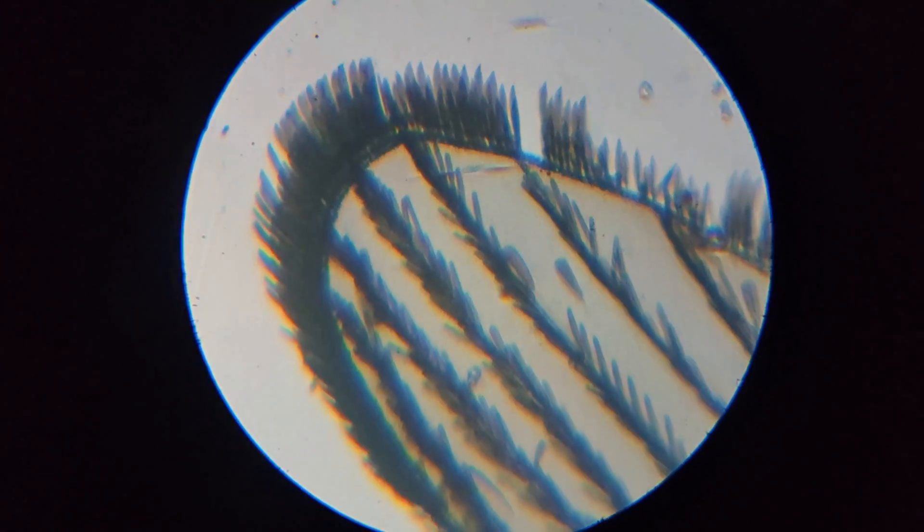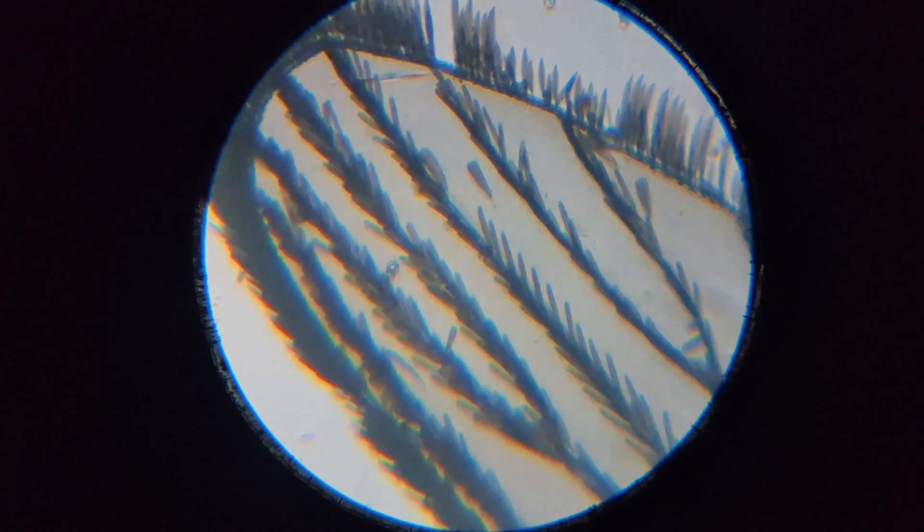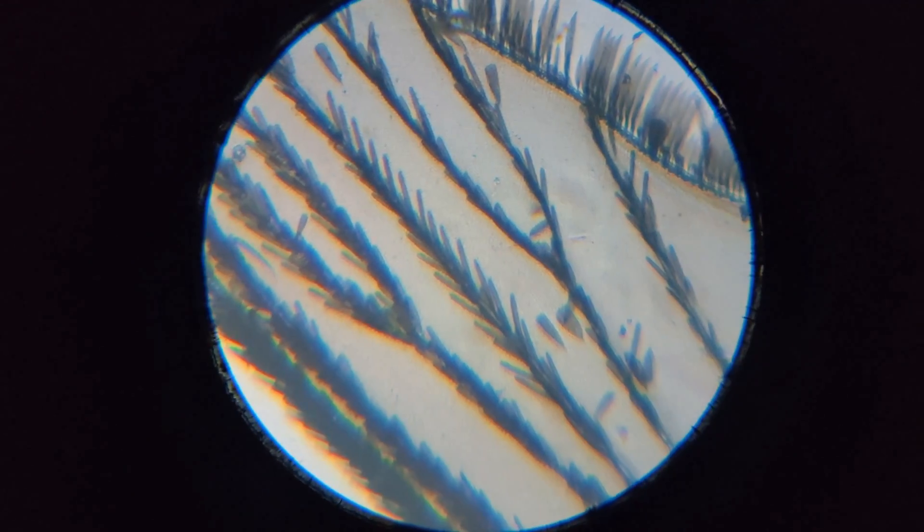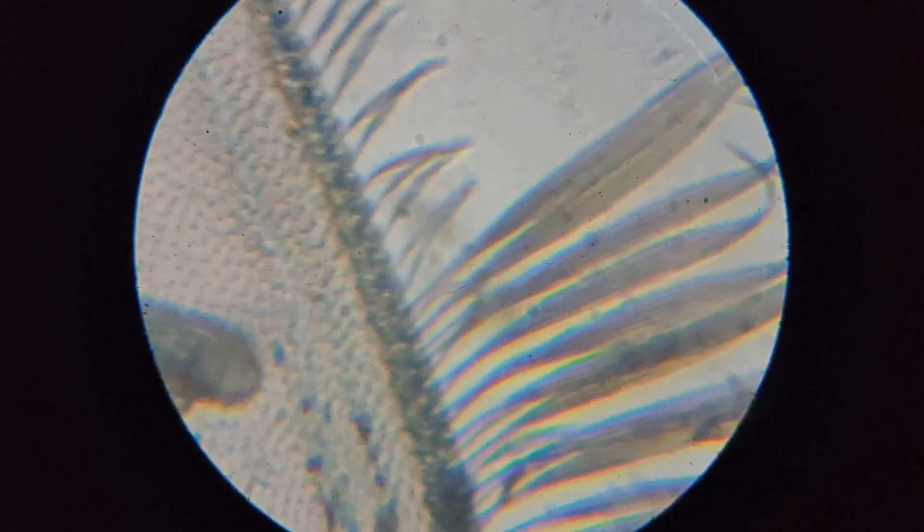But the wing of this mosquito really amazed me. I didn't imagine this. This is with 450x zoom. See, it also has feather-like buds.